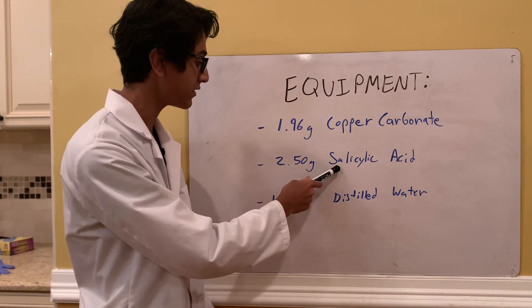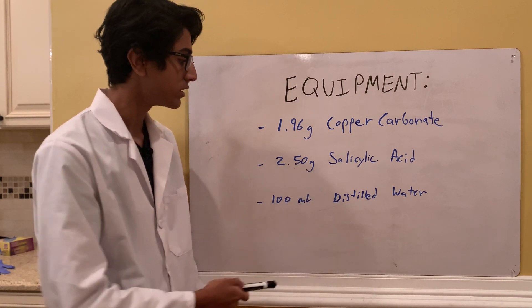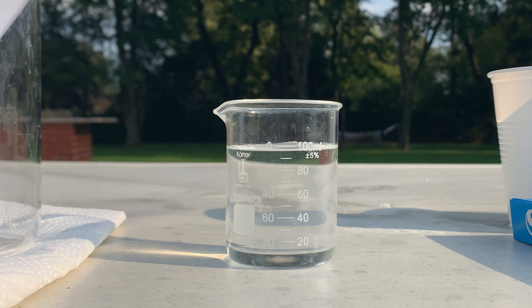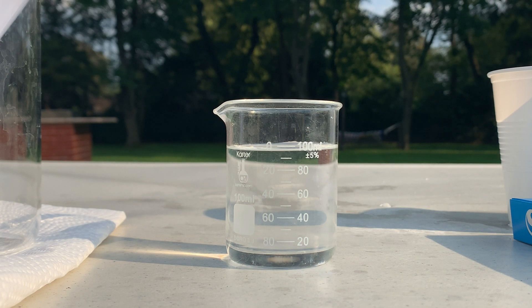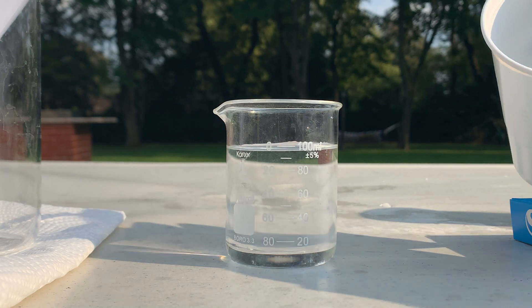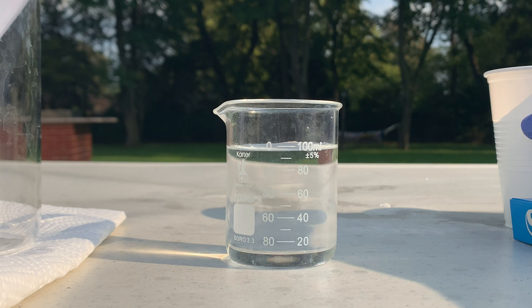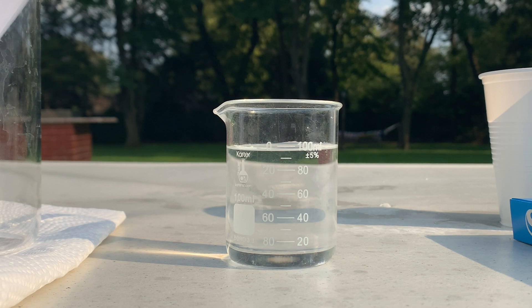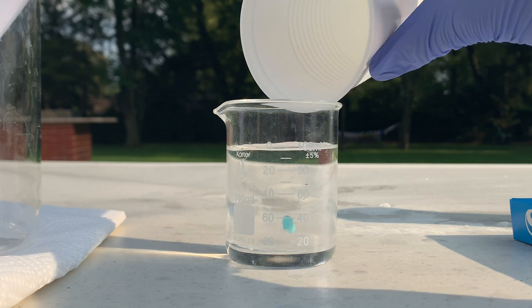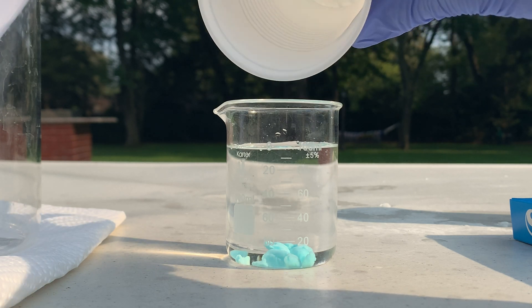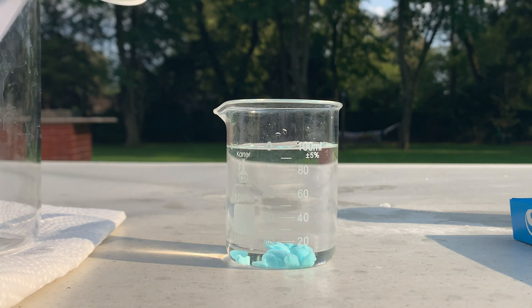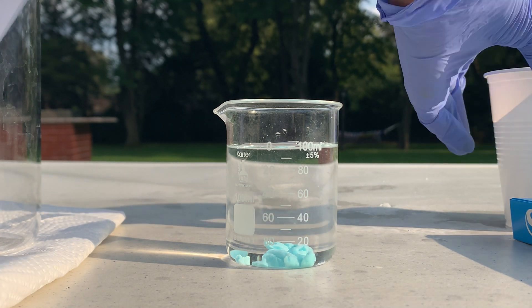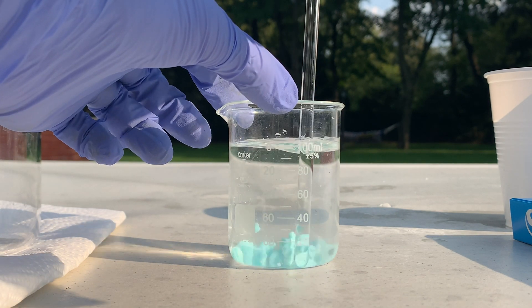We also need 2.5 grams of salicylic acid and 100 milliliters of distilled water, which should preferably be warm. I've got my very small beaker out because we're doing this on a small scale since I don't have much copper carbonate to spare. I warmed the water up a bit in the microwave, and I'm going to start by adding the copper carbonate to the beaker. All the copper carbonate has been added and I'm going to mix it around a bit.